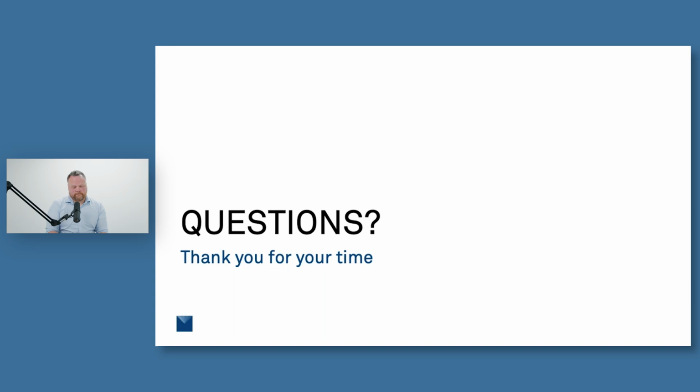All right. Good to know. This is a question that we've had with other instruments as well. Can you use the VARIOS in the field as opposed to in the lab, or being able to do both? But primarily they're asking about using the VARIOS in the field.